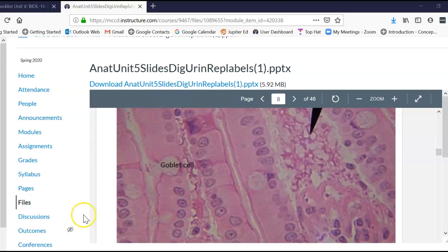This would be the microvilli, which means that the cells here, you can't see them very well, have lots and lots of little folds, see? And that creates the microvilli. We don't see the folds like that in a light microscope. We just see it as this band like you see here.